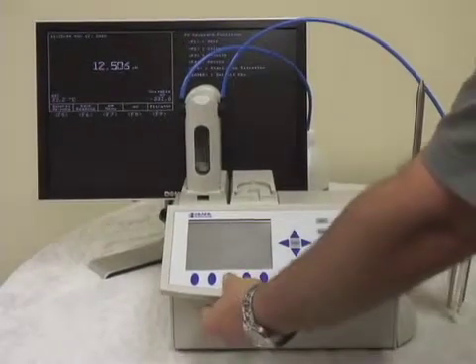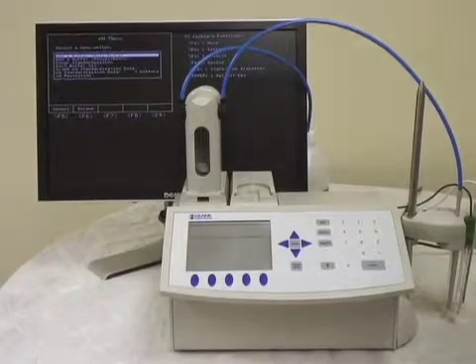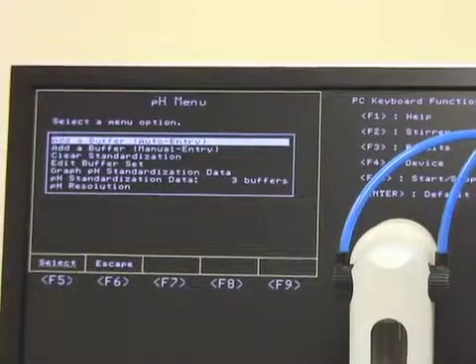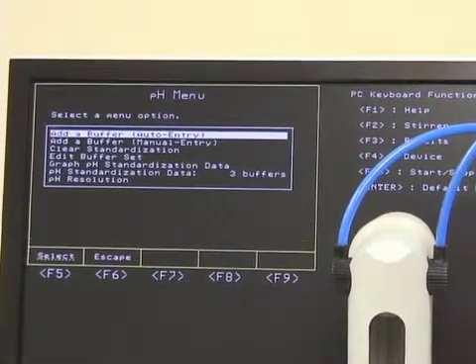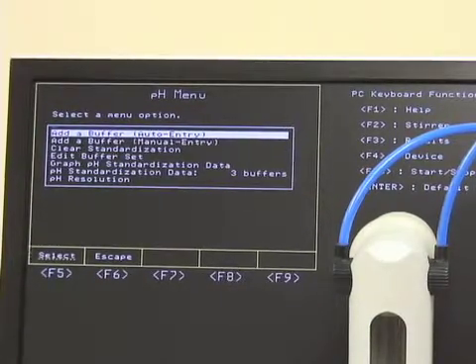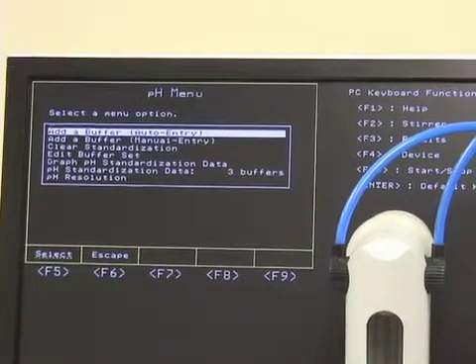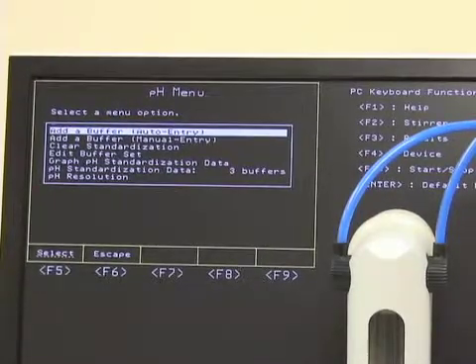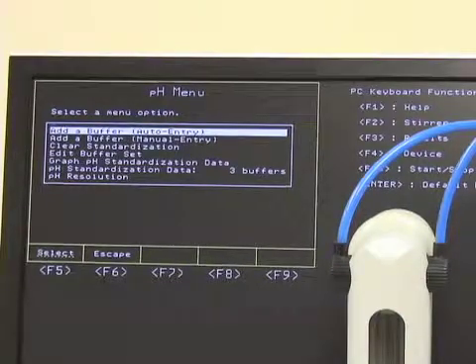We'll want to pull up the pH menu — this is where your calibration lies. We have some choices here. First is add a buffer auto entry, where you can pre-select the buffers you're going to use. Second is add a buffer manual entry — you'll type in which buffer you're going to use and hit select. Clear standardization data is what you'll want to do whenever you're replacing a probe, doing a thorough cleaning, or changing the inside solution. Edit buffer set ties to the auto entry option, where you select which buffers you'd like the machine to automatically calibrate to.